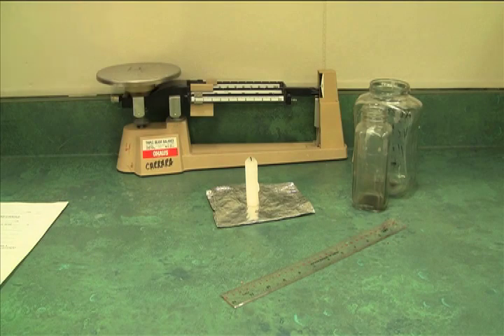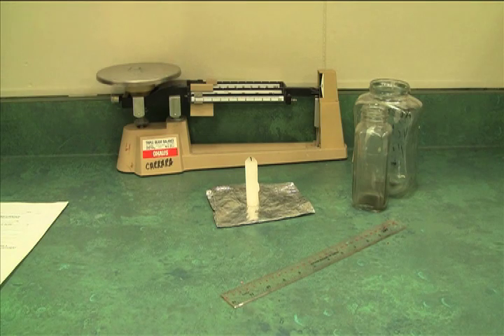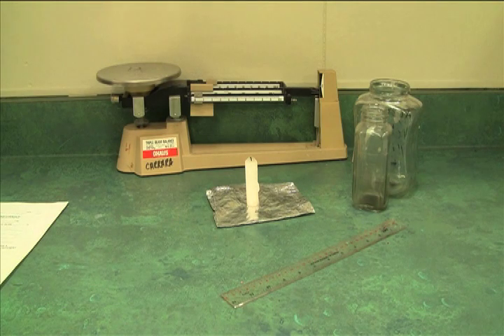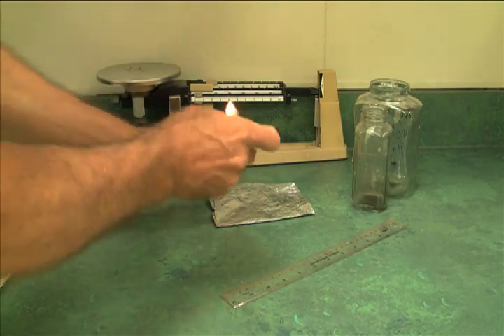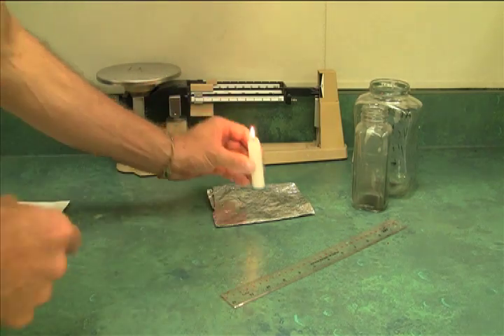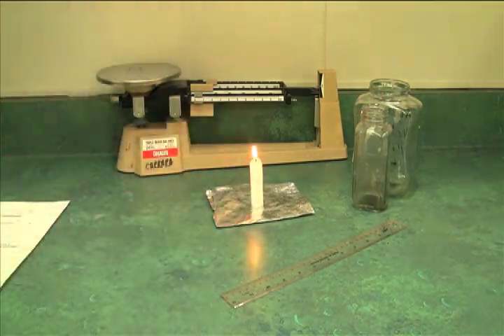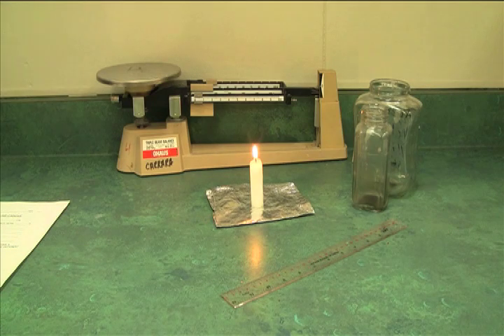Step four says, now light your candle and observe the flame closely. Draw a diagram of the flame showing its shape and labeling the different colors. So there's our candle. I'll zoom in so that we can get a close-up of that.